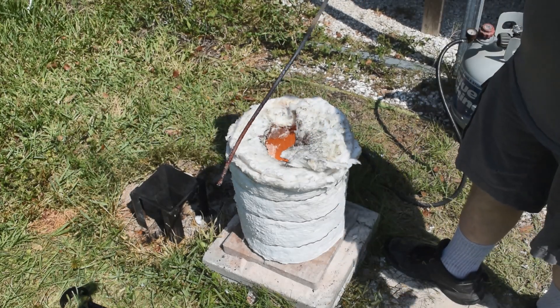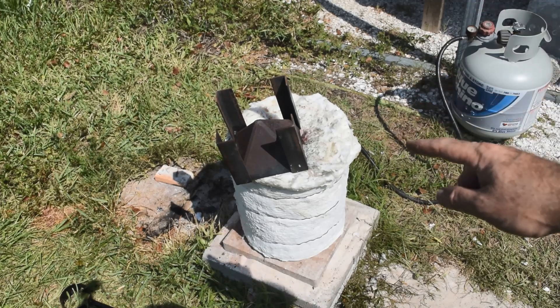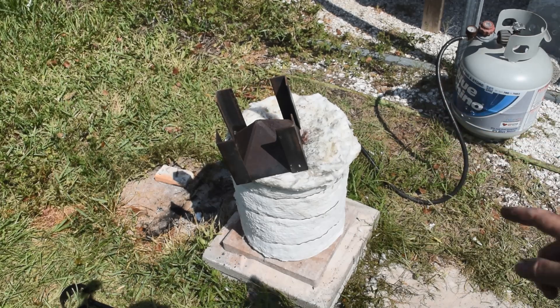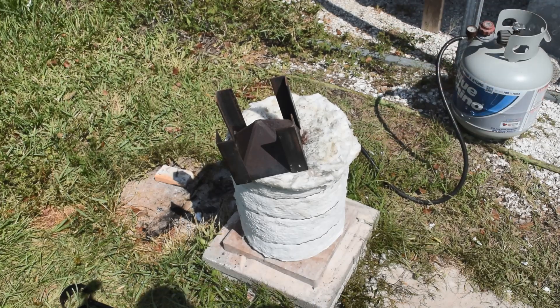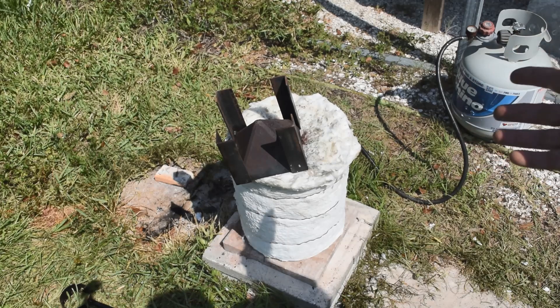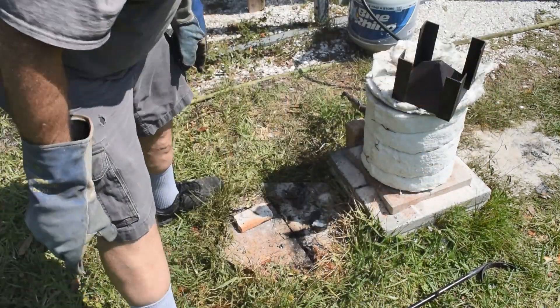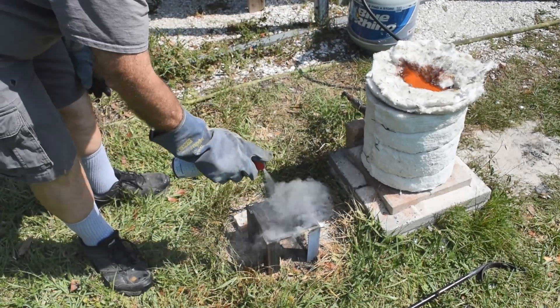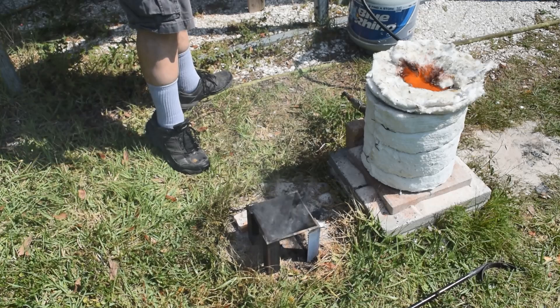I'm preheating the cone mold so I don't have a steam explosion when I pour this hot stuff in it. The slightest trace of moisture in there will cause a steam explosion when you pour hot metal or hot slag into a cone mold — or any kind of mold, actually. So you always have to be careful about that; preheat to burn off any moisture. This bolt's plenty hot. Let me spritz it with a little WD-40. That'll form a layer of carbon in there to prevent things from sticking to the mold, hopefully. Let's turn the heat off.